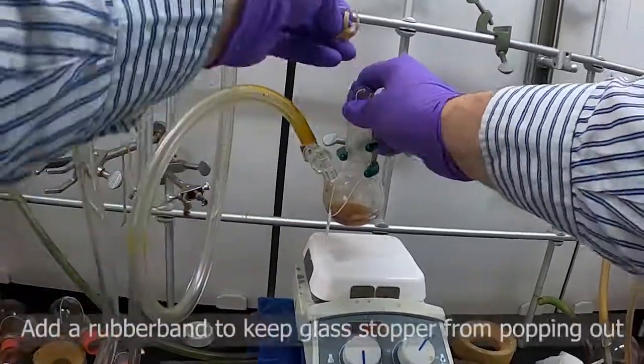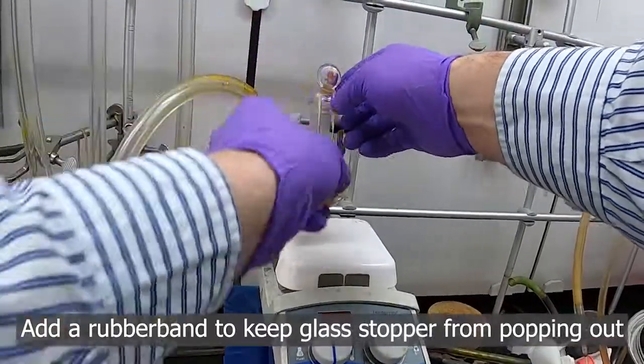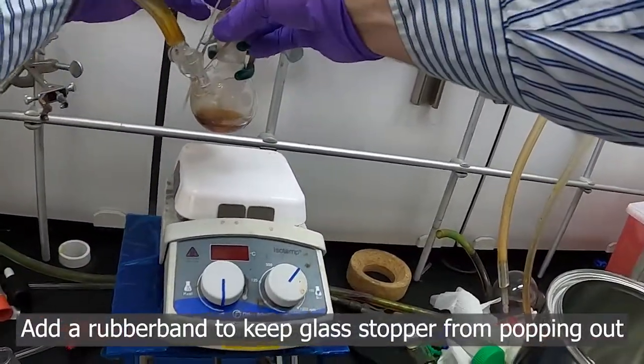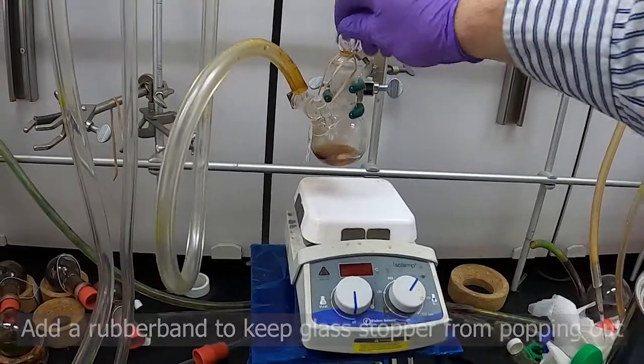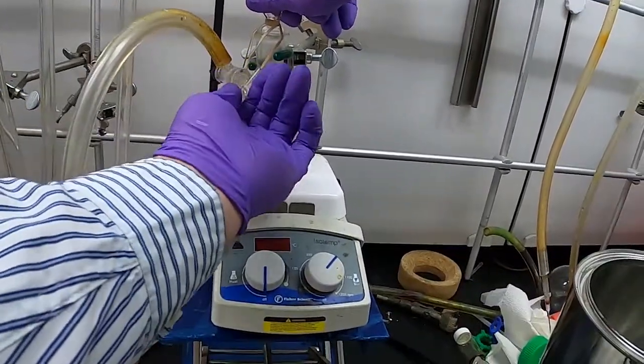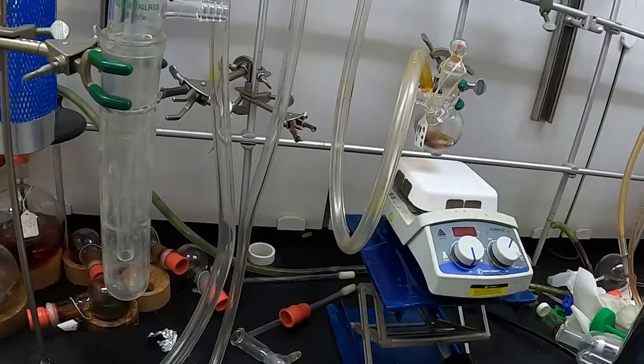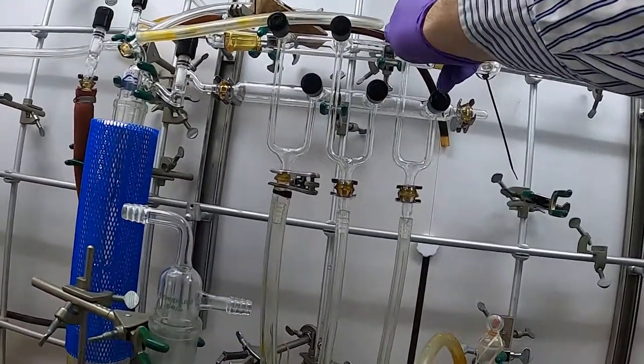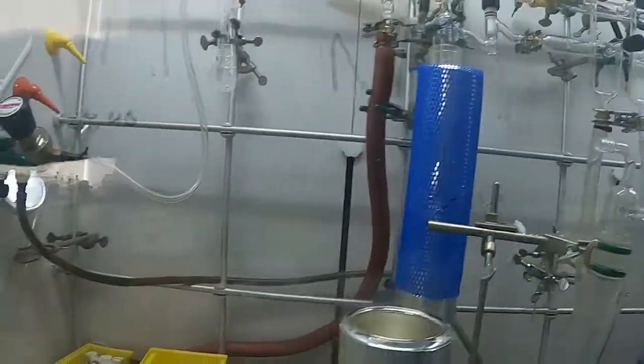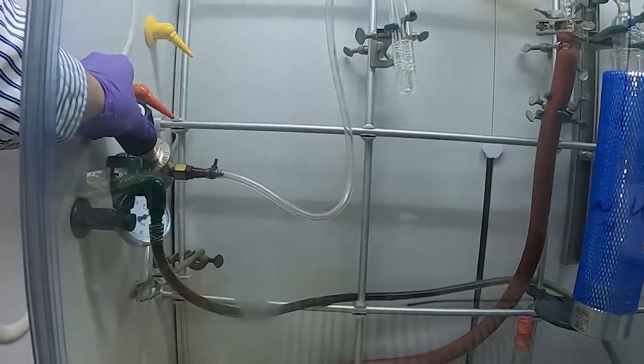The way we can hold that down is with a rubber band. There's a separate video on rubber-banding the flask. You want downward pressure to help hold that on. Then we close off the nitrogen, close off the line up here, close off our nitrogen flow, and turn back our gas a little bit over here.